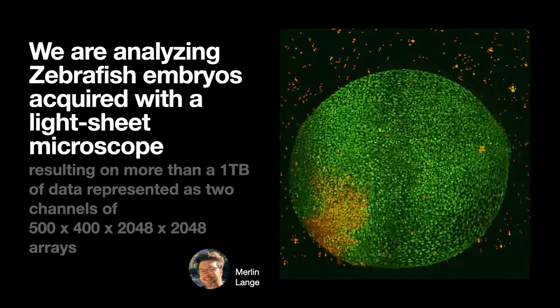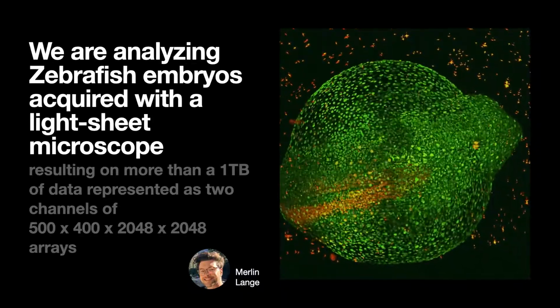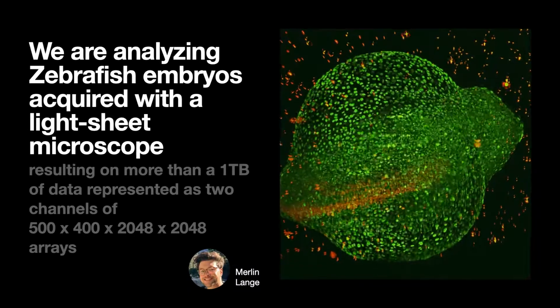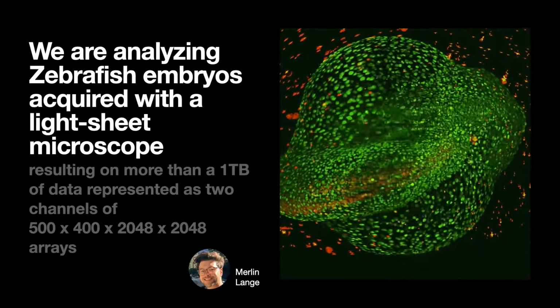We are studying zebrafish embryos acquired with our own light sheet microscope, resulting in a huge amount of data from very big volumes at several time points.